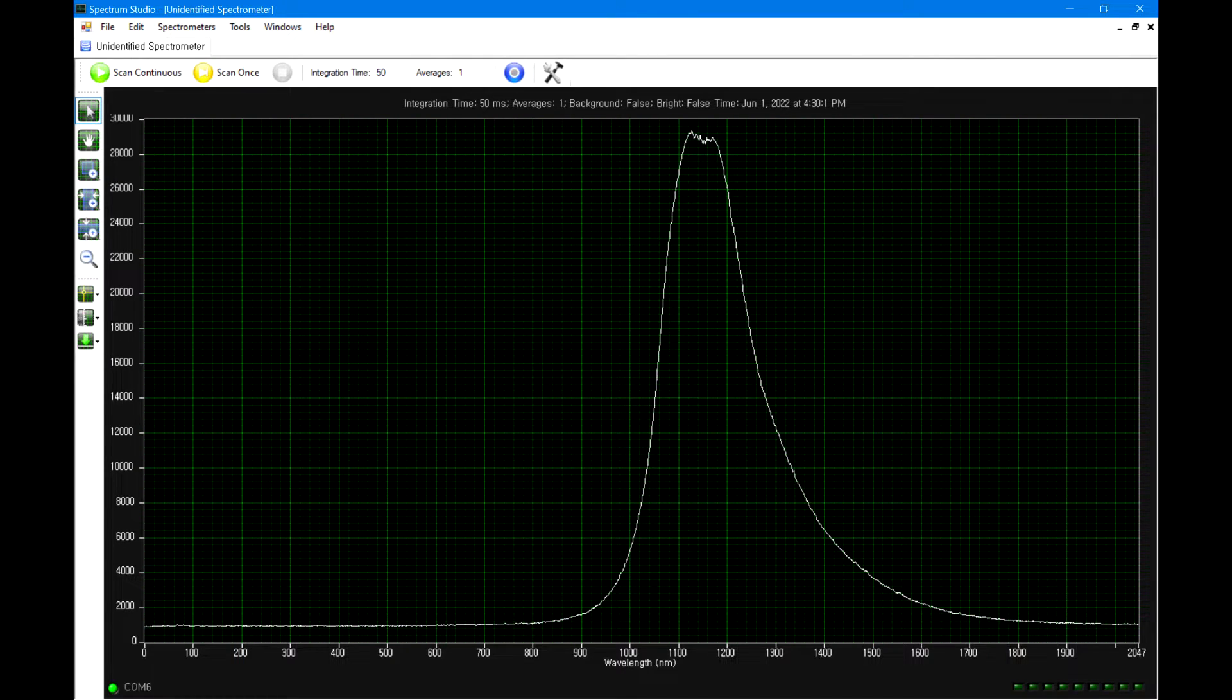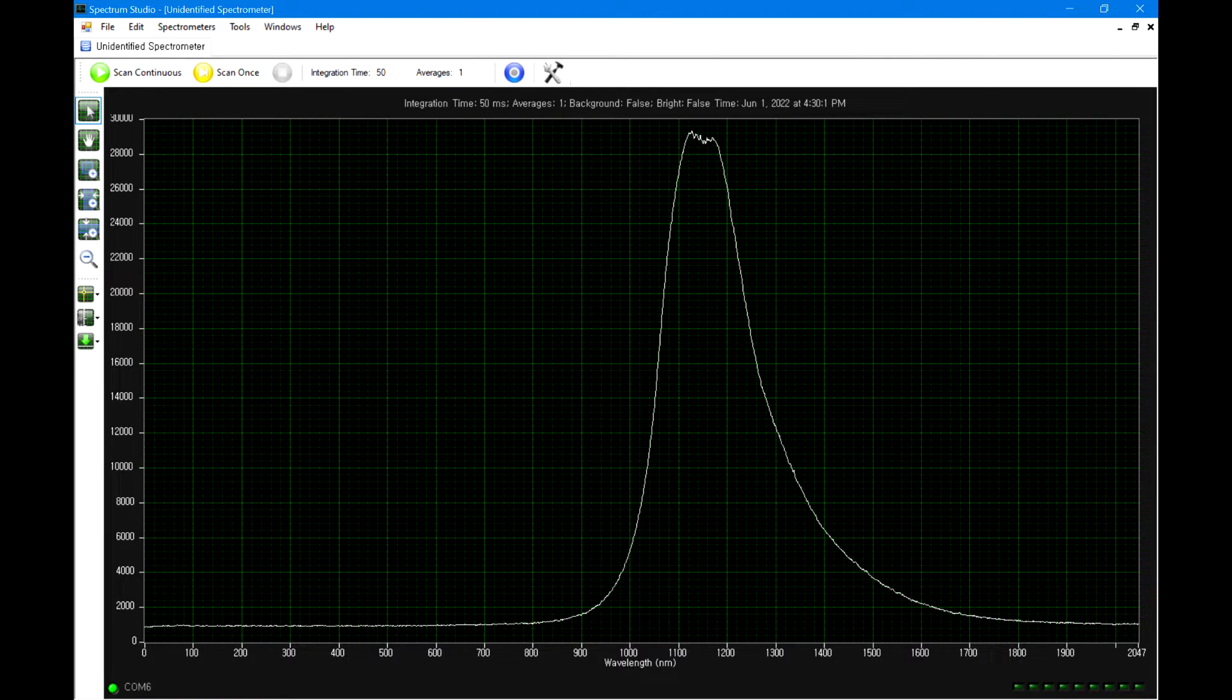I ran a test again using yellow LED, and it does make sense since it is shifted towards the right, but the peak wavelength was off again.